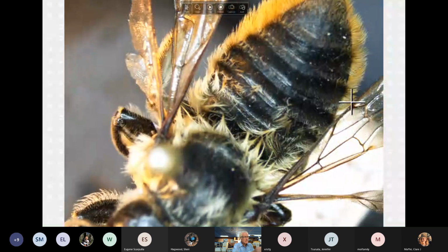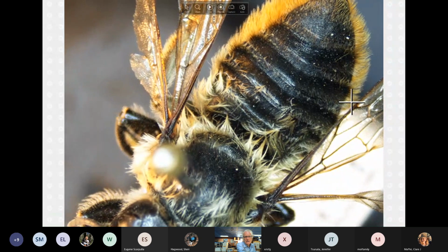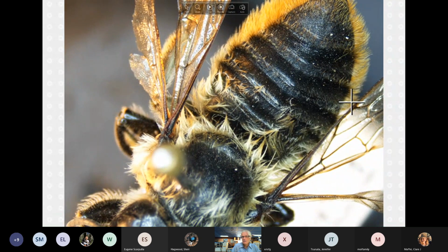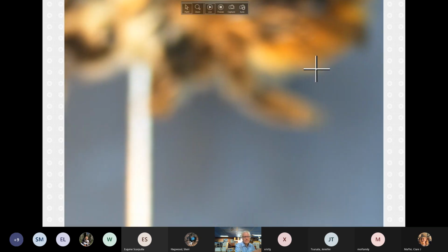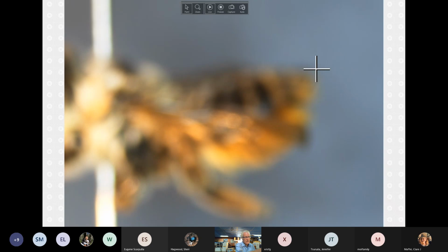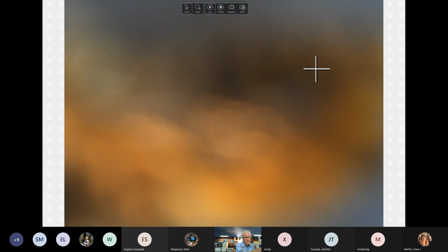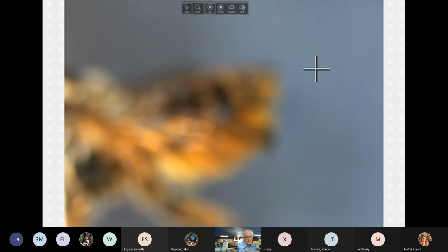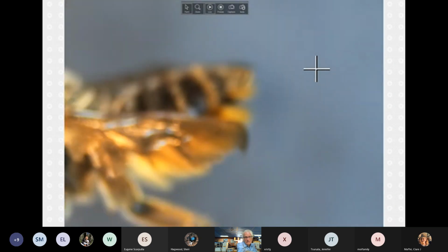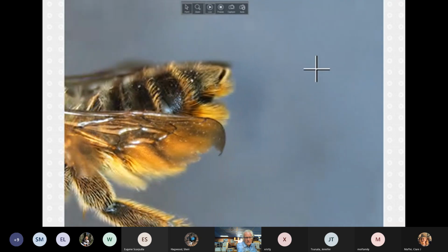So in this particular one, I'll turn this sideways too, because this is hard to see. A lot of times, again, when you have relatively sparse light colored hairs, you don't see them well when you look straight down, but we'll turn this to its side. And you can see more that the entire, it's also one of these visual things where if we're looking at it online digitally, it doesn't show as well as under the microscope where you can bend the specimen back and forth to see.